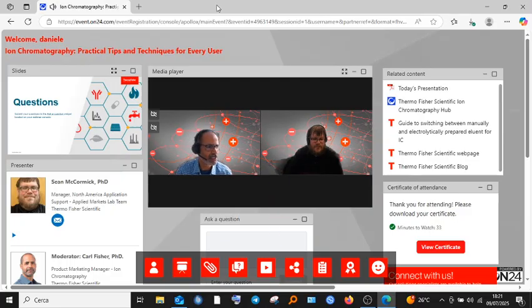Okay, so let's jump into the questions here. Can you explain the importance of sample preparation in ion chromatography?